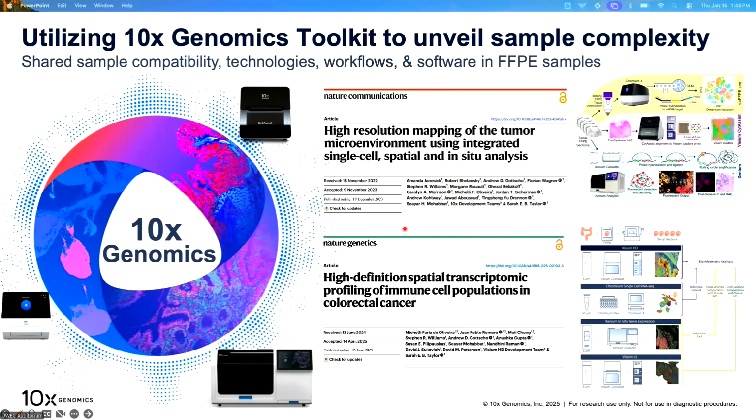So you remove the paraffin, and then you dissociate the tissue and you isolate the nuclei. So yes, there is an enzyme in there. We have 2 protocols, one which is xylene based, and now there is a new xylene-free protocol that works pretty well, actually. And then I believe we use Liberase.